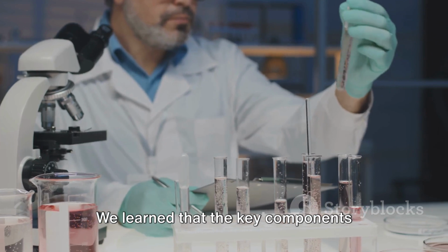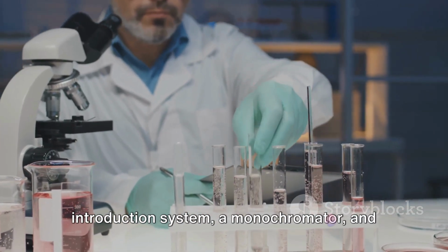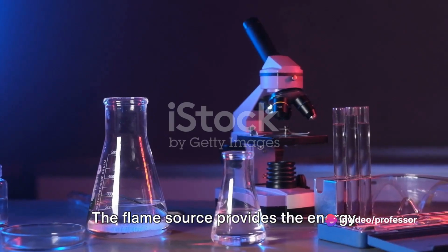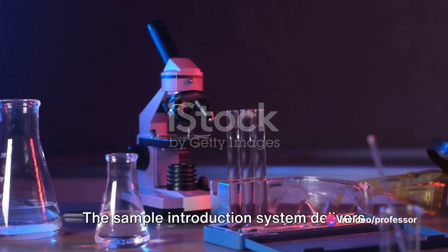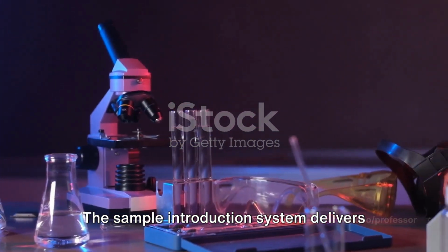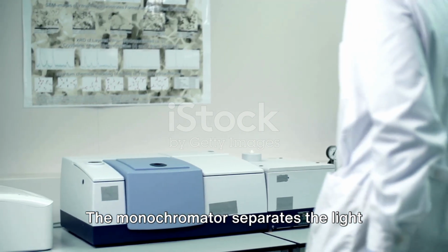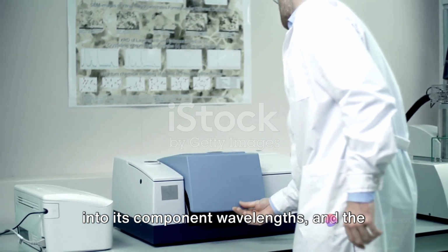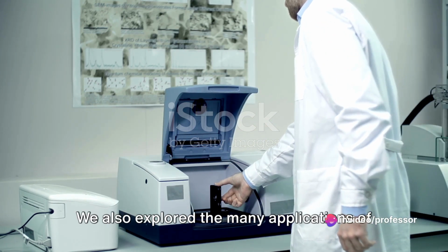We learned that the key components include a flame source, a sample introduction system, a monochromator, and a detector. The flame source provides the energy needed to excite the metal ions. The sample introduction system delivers the sample into the flame. The monochromator separates the light into its component wavelengths, and the detector measures the intensity of light at each wavelength.